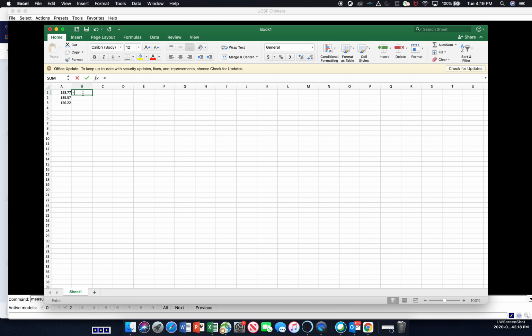I'm going to divide that by 0.932 and drag that down to get 164.98, 145.46, and 167.61.